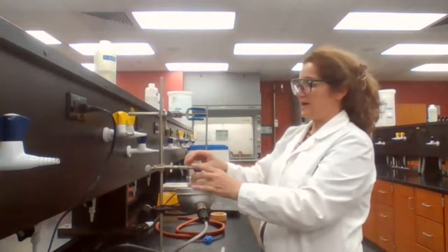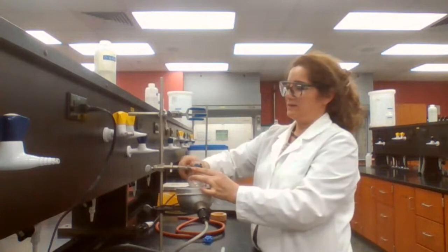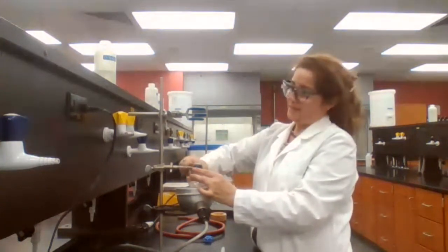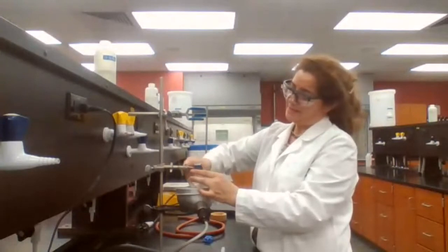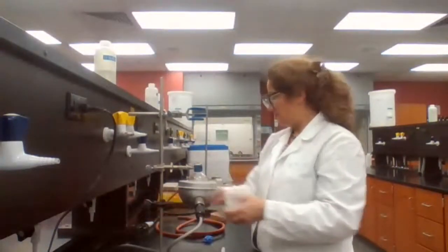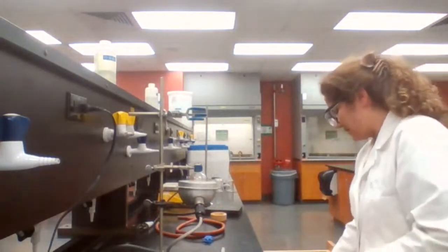We are going to set up first with the empty flask just to complete the setup. Then I will add the chemicals later. So basically I lower the heating mantle later to get the chemicals into the flask and put it back.